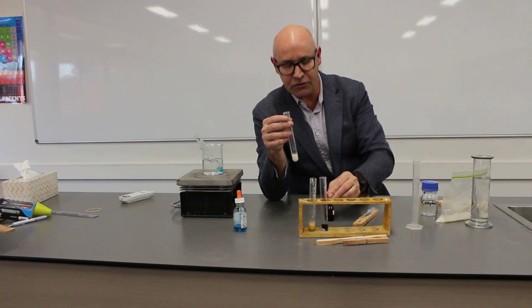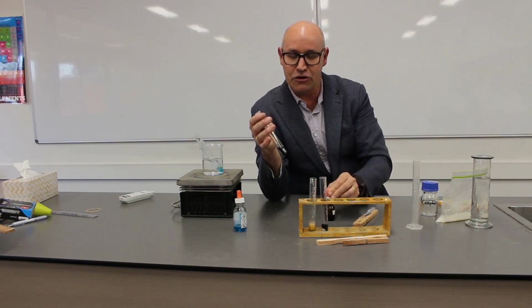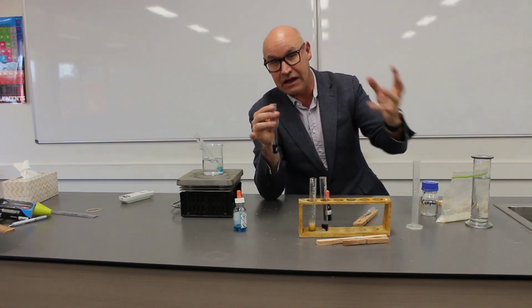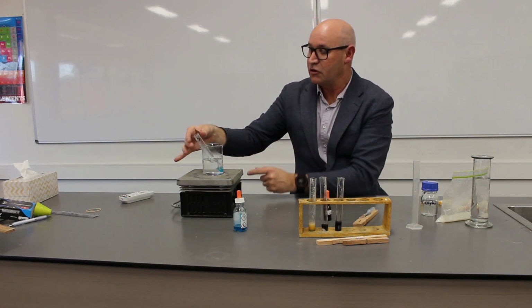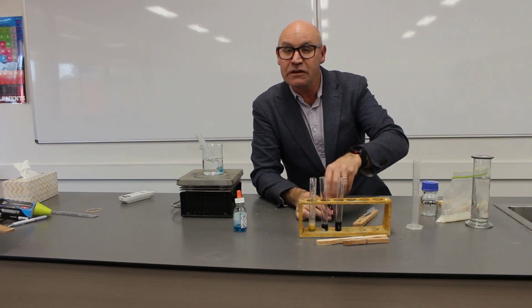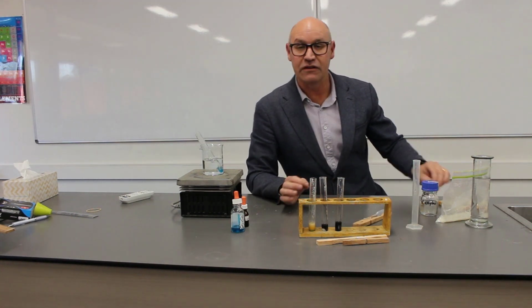Are we expecting to still have starch in there? I would think so. And that's confirmed. So what does that mean? It means that not all of the starch has been broken down into glucose yet. That's probably what we'd expect. Now, we're going to allow the Benedict's test to occur whilst we set up the third part of the experiment, simulating the small intestine.